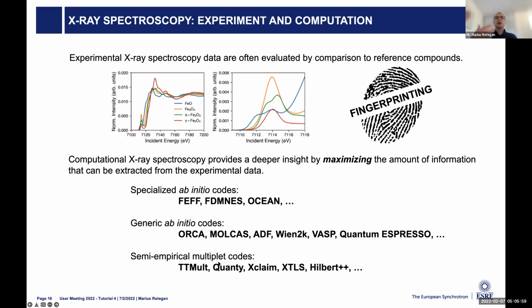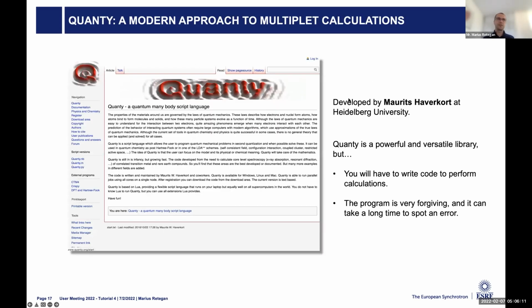Now, one program that is now used more and more to do this type of calculation, and this is the type of calculation that I'm going to talk to you briefly about, is a program developed by Maurits Haverkort, which is called Quanty, and he's at Heidelberg University. Quanty is a very powerful and versatile library.